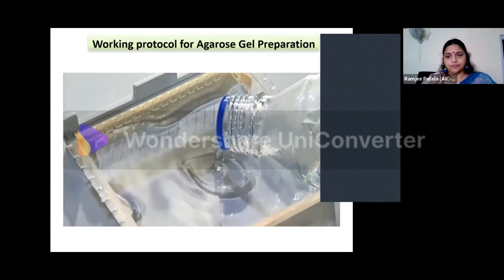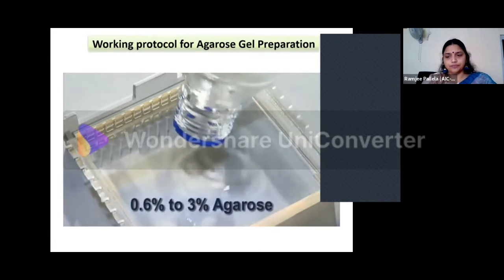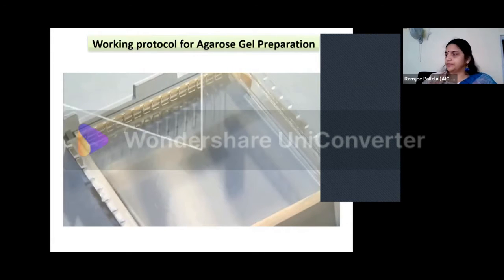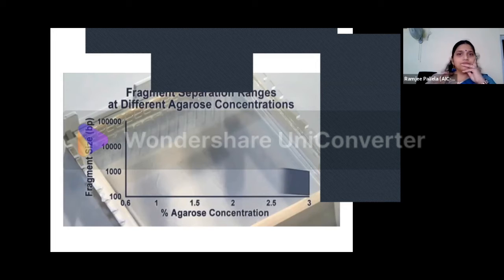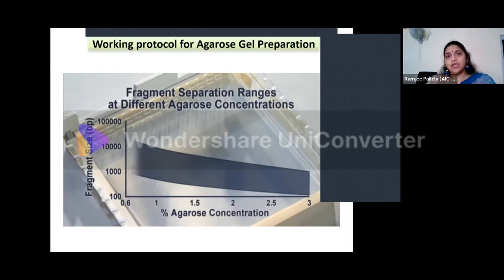Agarose gels can be made with varying concentrations of agarose, between 0.6% and 3%, depending on the size of the fragments you wish to separate or resolve. Smaller fragments are resolved better in a gel with a higher percentage of agarose, and larger fragments are resolved better in a gel with a lower percentage. You remember Madhuri ma'am told you this yesterday, how the gel concentration can actually affect the movement of your DNA molecules. Okay, so what happens is, if you are using a higher percentage of gel, then smaller fragments can be easily resolved.